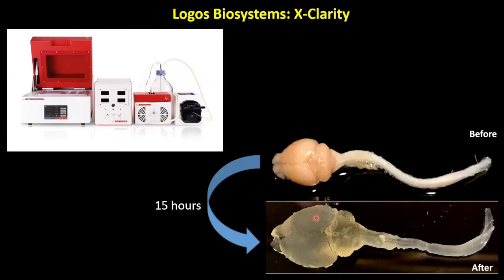And the reason you can still see this entire tissue here is because this tissue is in air. The air has a different refractive index than the tissue. Therefore, you can see it. But after matching the refractive index of 1.45, this tissue will become transparent, almost invisible in the solution.